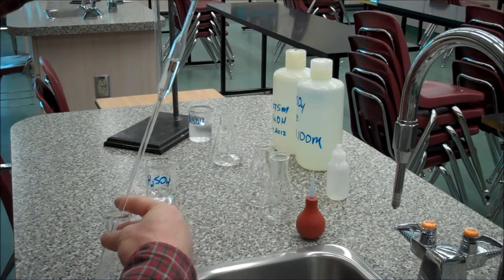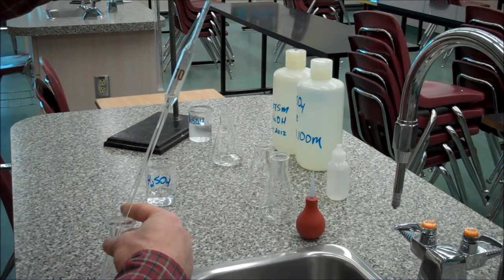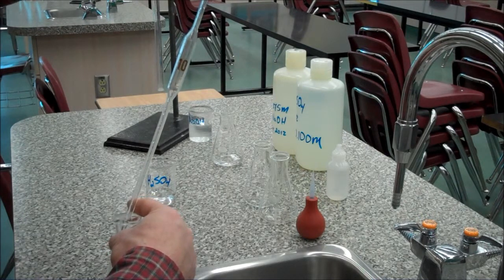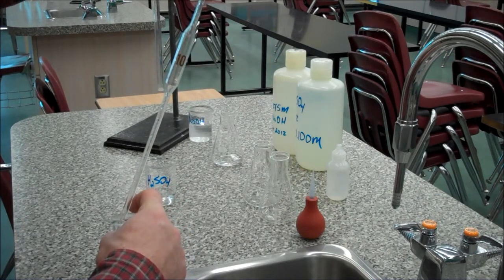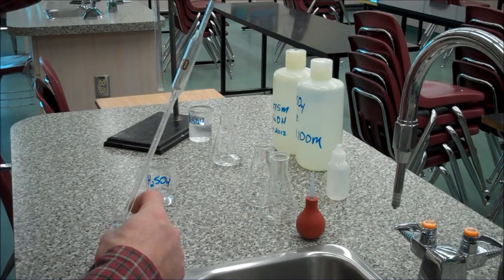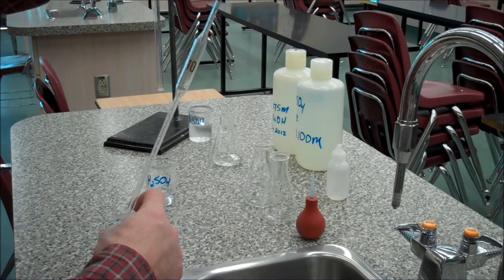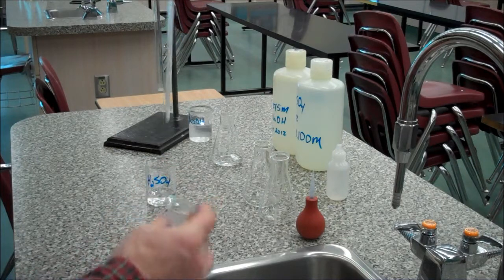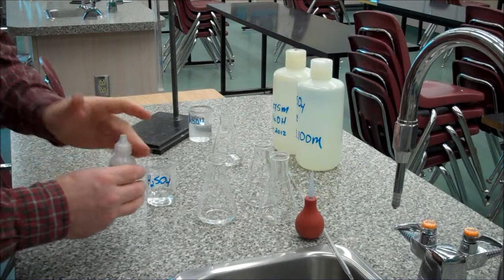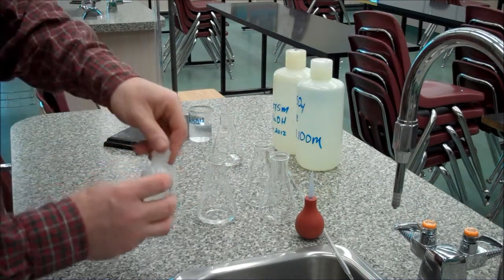And so these pipettes are 10.00 mL, plus or minus 0.04. And it's to deliver in 11 seconds. Which means once it gets to the bottom and you think it's empty, wait 11 seconds with the tip touched to the side. And at 20 degrees Celsius, that's 10.00 mL, plus or minus 0.04. Anyway, so there it is. I'll put 1 drop of phenolphthalein in. That's the indicator for our titration.